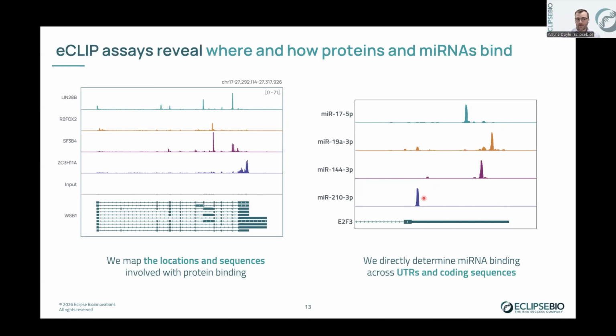Since this is an assay that enriches for the RISC complex, we also can use this to look at siRNA off-targeting, which we enrich and see where does every siRNA bind, allowing for a really strong profile of off-target activity across the system.